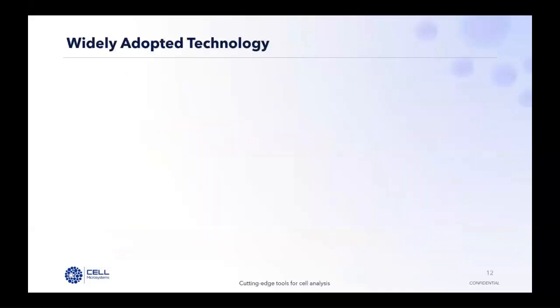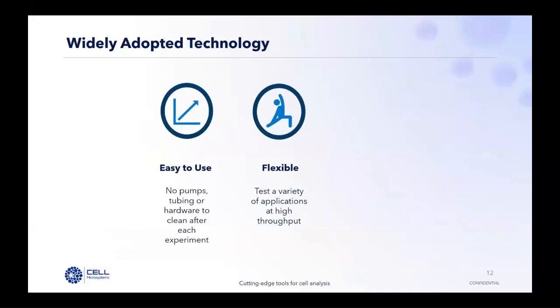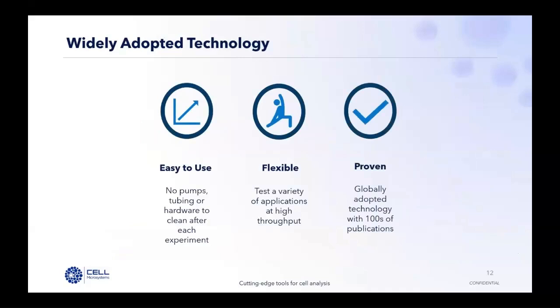With its flexibility and ease of use, the BioFlux is the gold standard for shear flow research. There is no tubing to clean up after each experiment. Setup and maintenance is simple. It supports a wide range of assays, helping you generate more data faster and at lower cost.